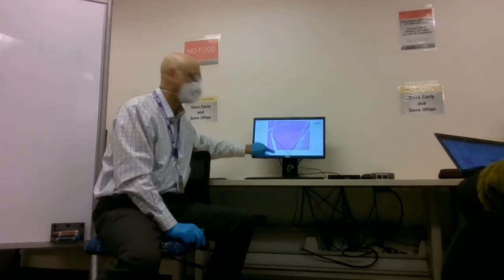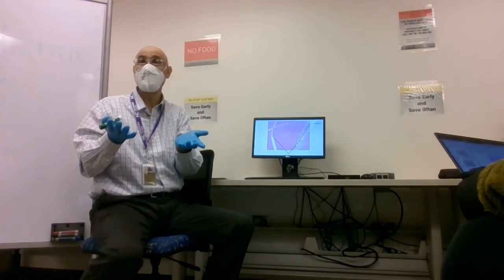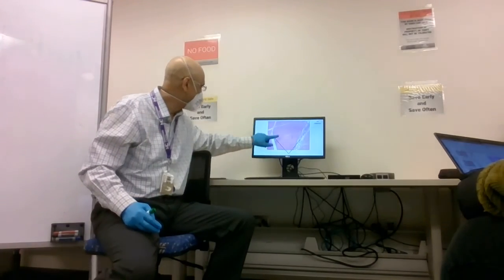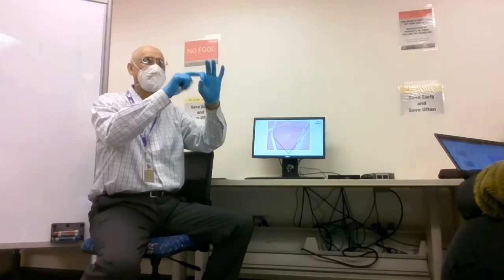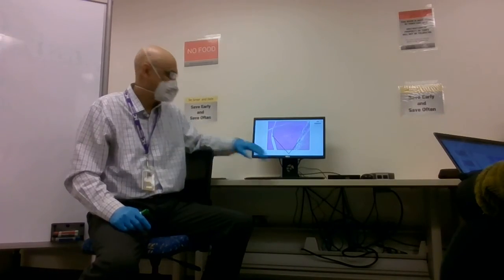What is this whole green outline? Quickly, this whole structure, what is it? On the exam, if it says, what is this whole structure? You will say it is the fascicle. But if it says, what is this connective tissue around it? It's the perimysium. And you can see individual cells here now. How do you say this is an individual cell? Because it has nuclei in it, right guys? Agree or no? Yes. So if you see this empty space around the cells, that is the endomysium.